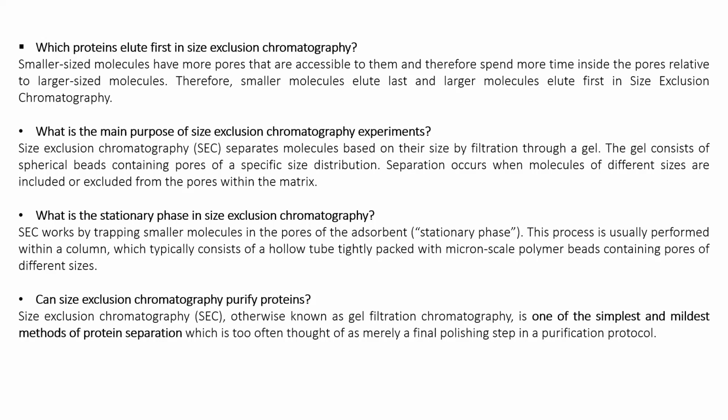You saw how the column looks. Since you haven't seen it yet in the laboratories, it is very close to how a burette is. A burette is much longer actually, but in column chromatography, you will see that you're working on smaller lengths or smaller heights of the column, because obviously you're working on biomolecules and you never get too much of it. So you have to really work in say 2-3 batches to extract that amount of your sample. Secondly, we are using commercially available polymers, which are very expensive. So you cannot pack a really big tall column. You have to work on smaller volumes because they come very expensive.